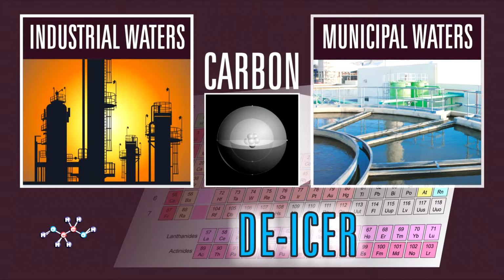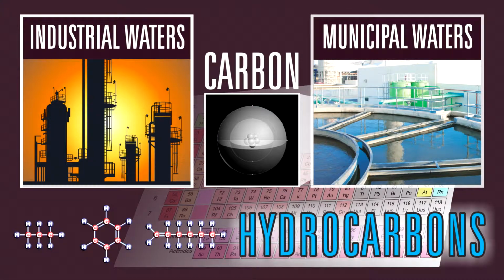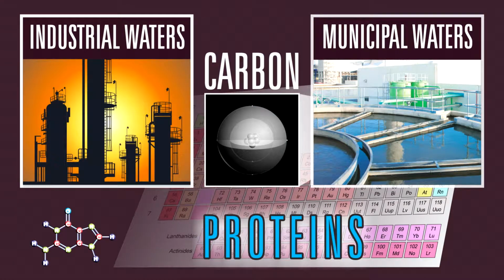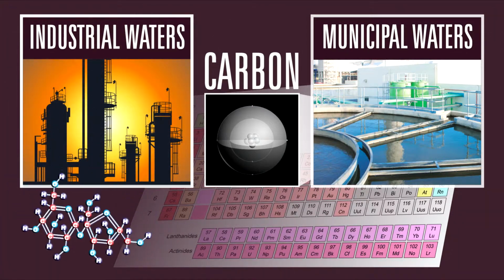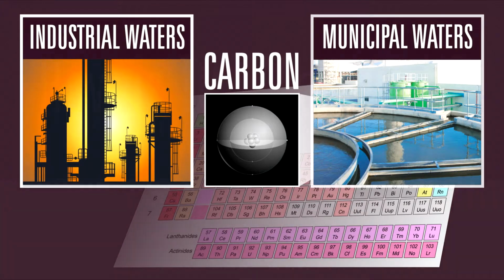Monitoring the total organic carbon, or TOC, quantifies organic constituents in municipal and industrial waters. This helps assure safe water supplies, improves processing, protects against product loss, and safeguards the environment from non-compliant discharge.